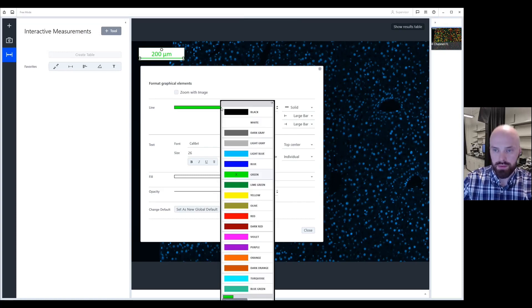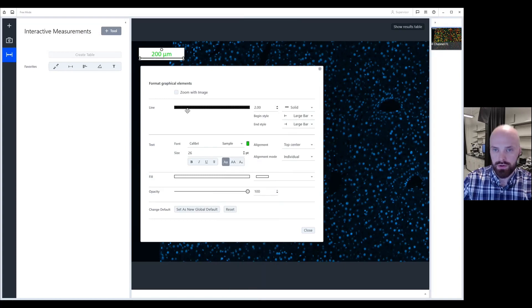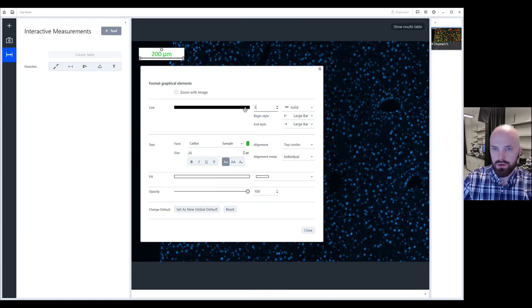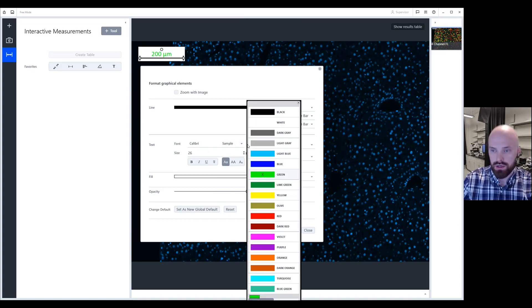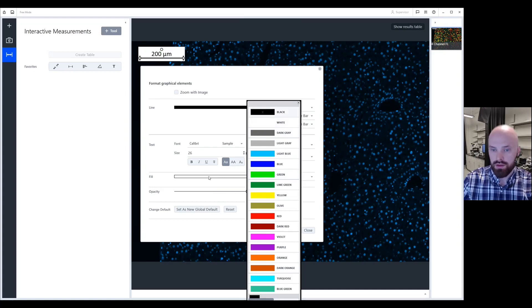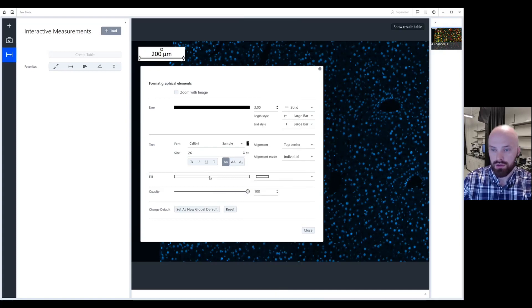So just wrapping up, this is where we can change the color of our line. This is where we can change the weight of the line. Here's where we can change the color of the font. And then finally, here are our fill options.